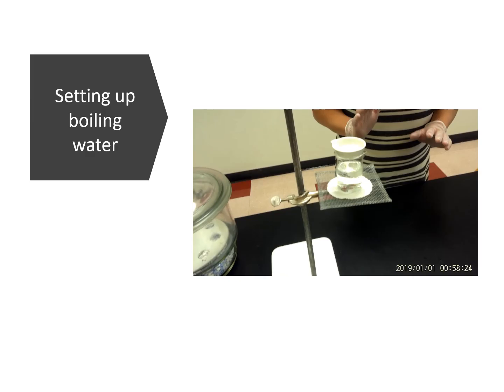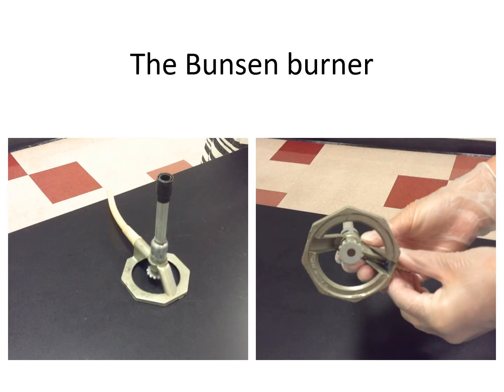Okay, so now that you know how to set up your double boiler to evaporate the water, let's talk a little bit about the Bunsen burner. So the Bunsen burner has several parts. This is the tube that goes to the gas on your lab bench. This is a gas inlet. On the very bottom, it's called a needle valve, and I know you've seen the video for the safety talking about how to use a Bunsen burner. Make sure this is open about 1 turn, maybe 1.5 turns.